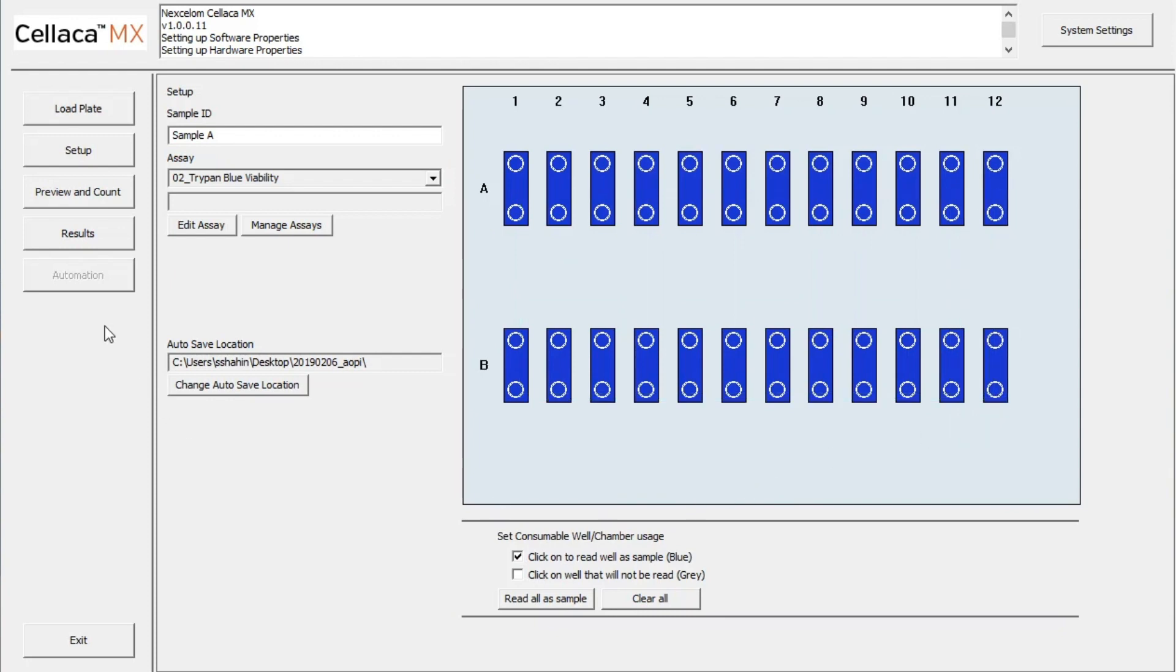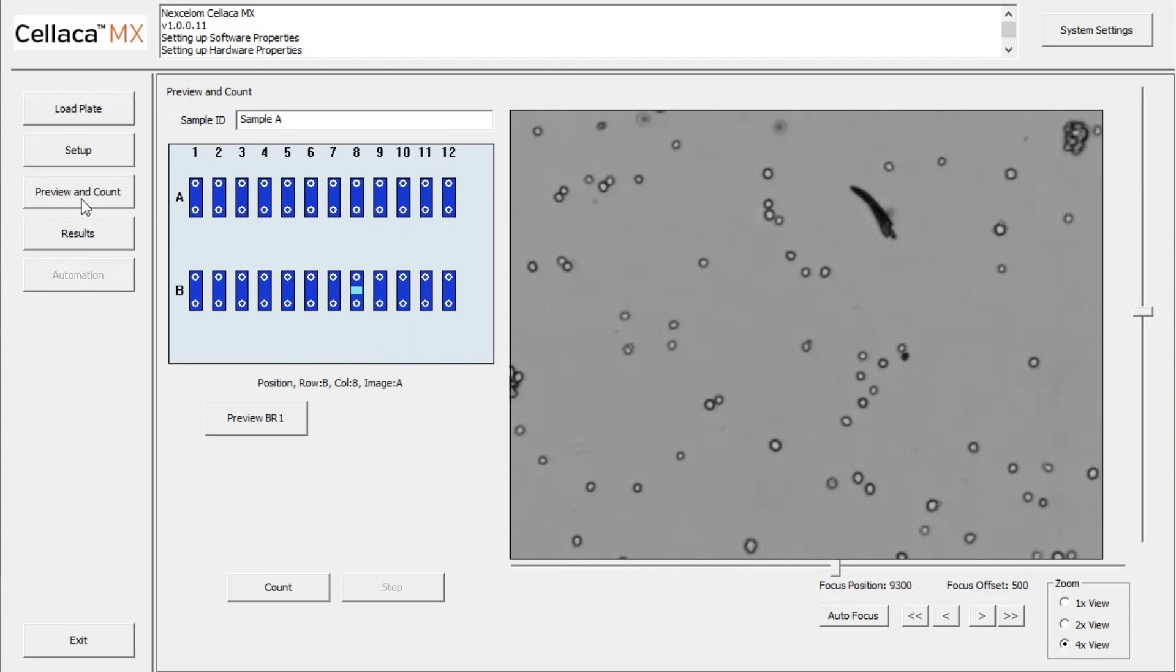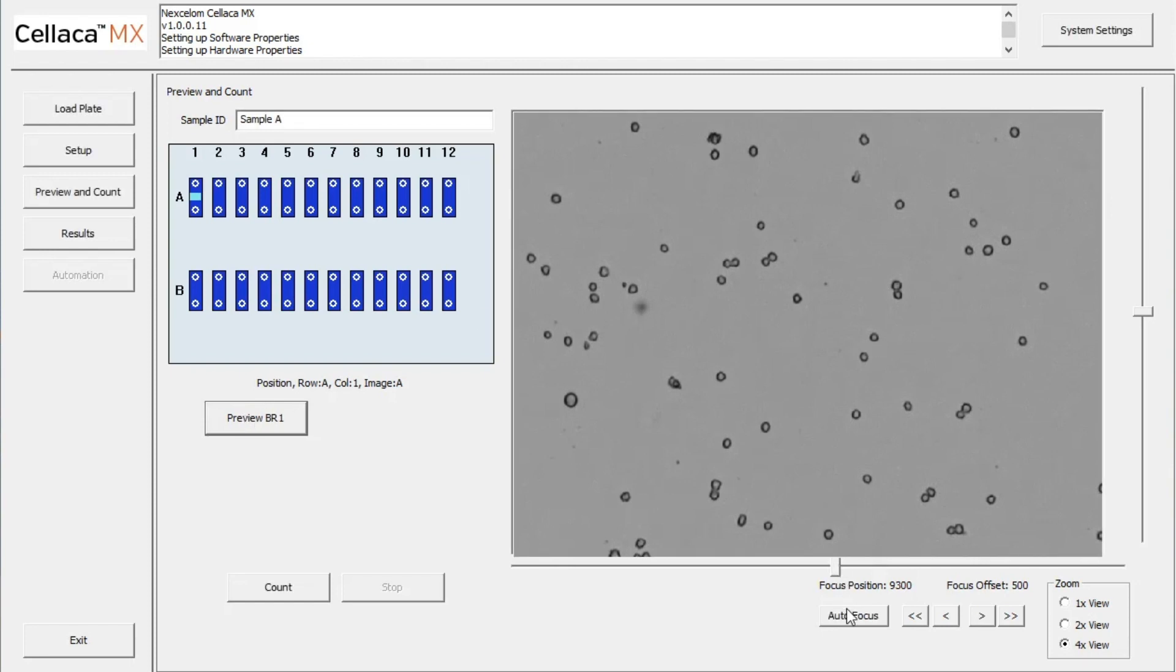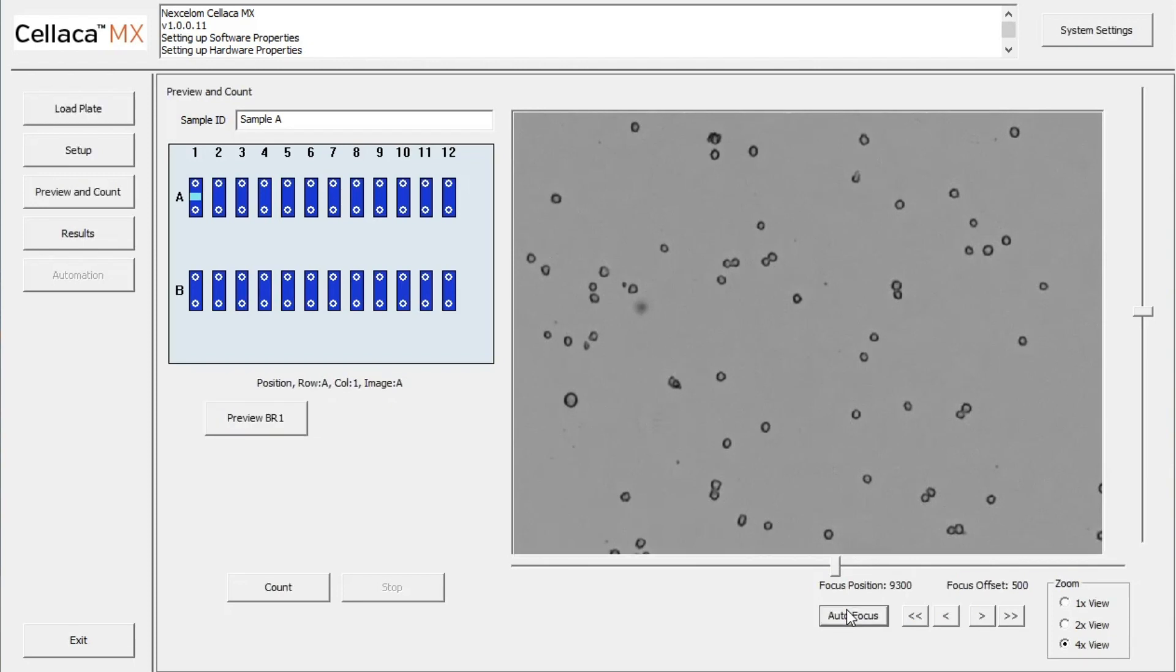By clicking the Preview and Count button, the plate is ready to be prepared for data acquisition. Preview Brightfield 1 allows us to see the cells in Well A1. While manual focusing is an option, automatic focus can easily be performed by clicking Autofocus.